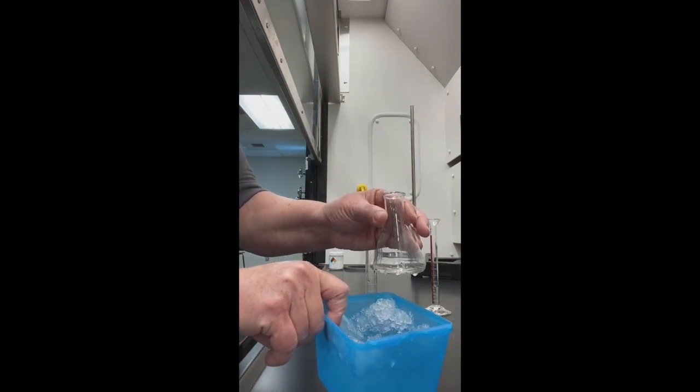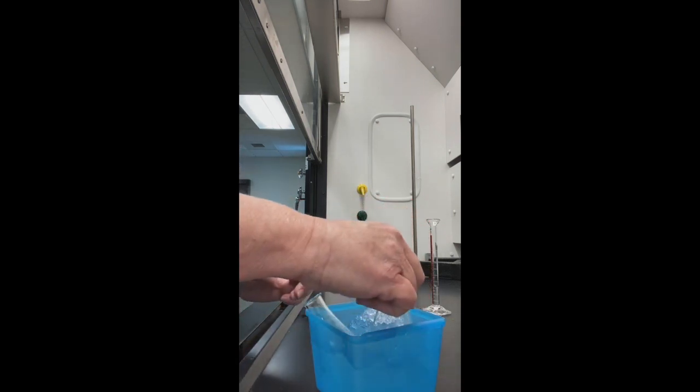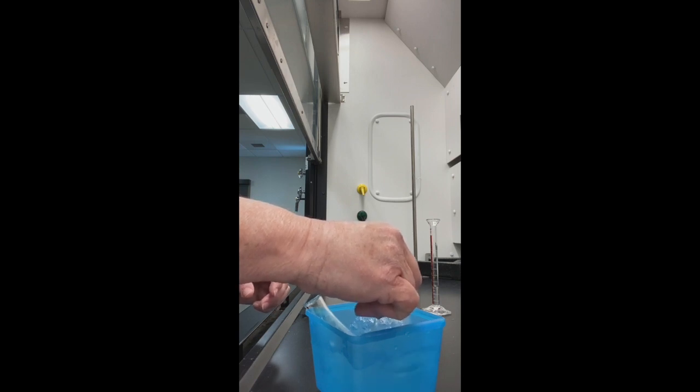The ice bath is about three-fourths ice and one-fourth water. That'll make it nice and cold. I'm going to swirl it just a little bit so it gets exposed and it can be nice and cold.